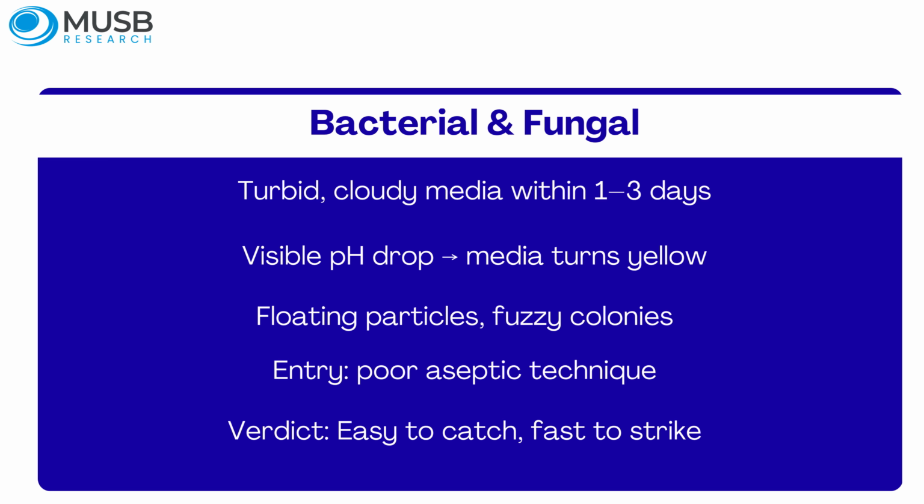How does it get in? Poor aseptic technique, an uncapped flask, a contaminated pipette tip, an unsprayed surface. This is the contamination that punishes carelessness, and it hits fast.